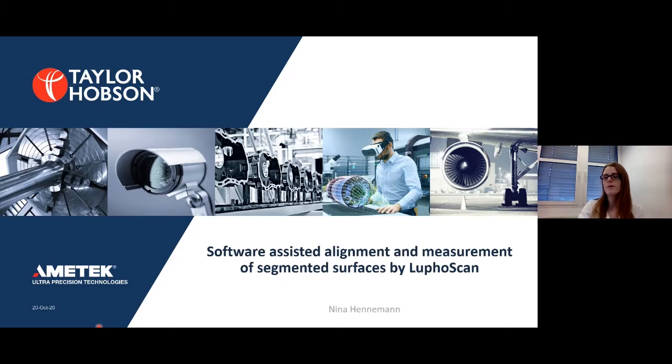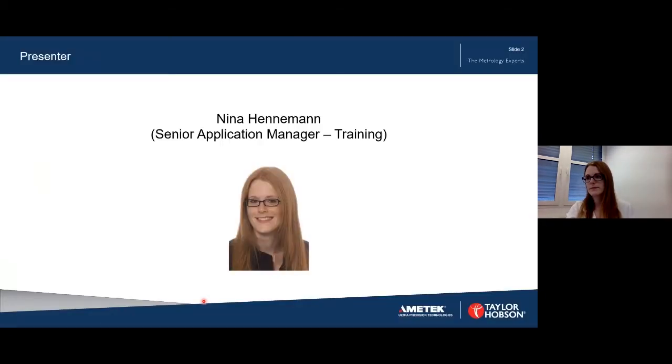I'm Nina Hennemann from Luphos Taylor Hobson, and I'm going to talk about software-assisted alignment and measurement of segmented surfaces by LuphoScan. How it works.